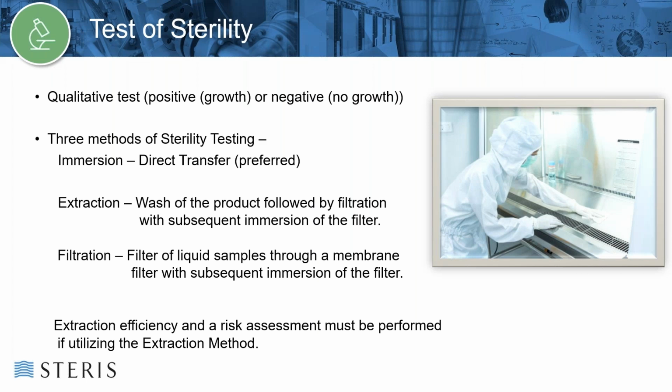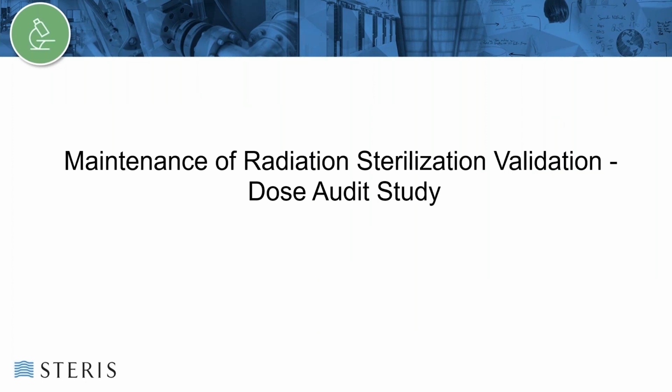Similarly, if the sample is a liquid, the filtering of that liquid can be performed and the membrane filter placed into growth media. If the extraction technique is used, extraction efficiency must be appropriate, and a risk assessment must be performed if utilizing the extraction method.